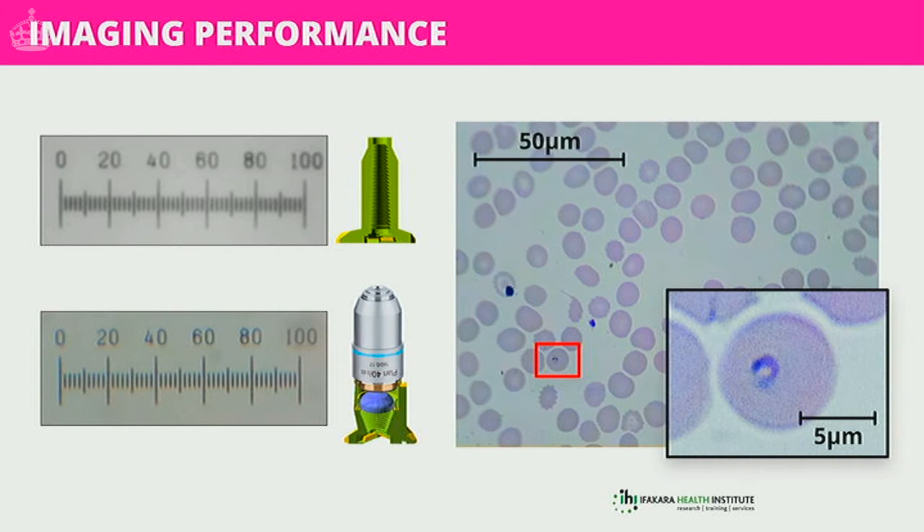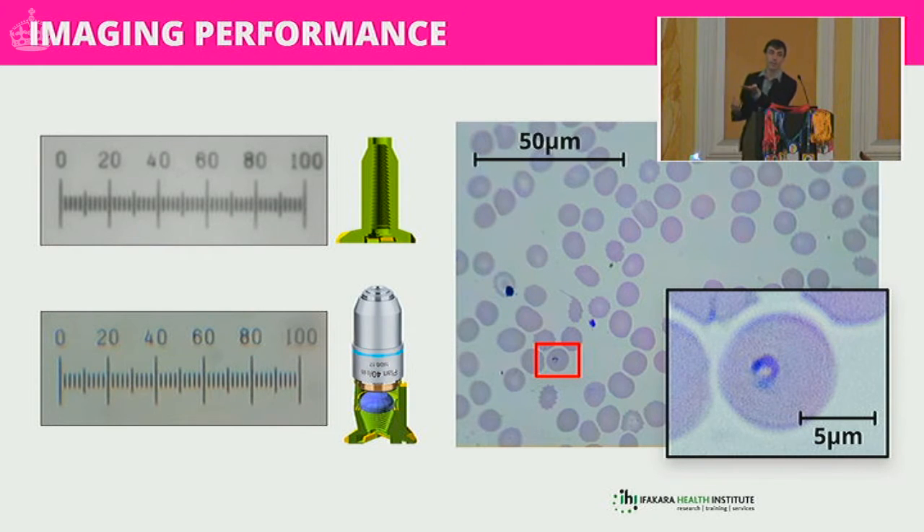We actually have two versions of the microscope. We realise not everyone can source microscope objectives — they're quite specialist — so there's an alternative: you can make a reasonably good microscope by taking the Raspberry Pi camera, unscrewing the lens from the front, moving it up a little bit, and screwing it back. We have a 3D printed part that lets you do that — you sandwich the 3D printed part with the camera and the lens.